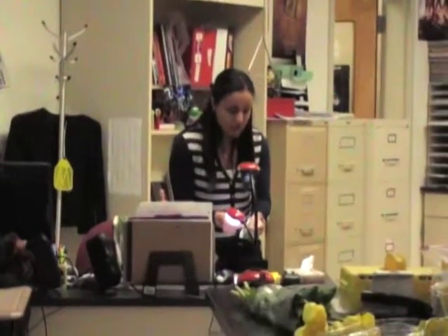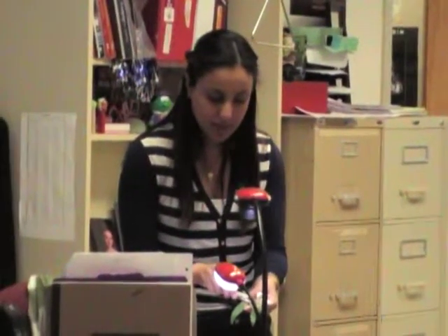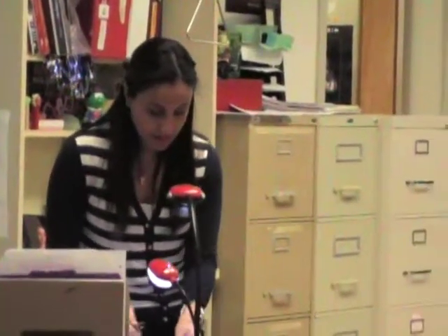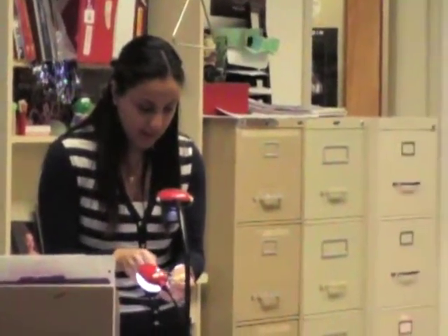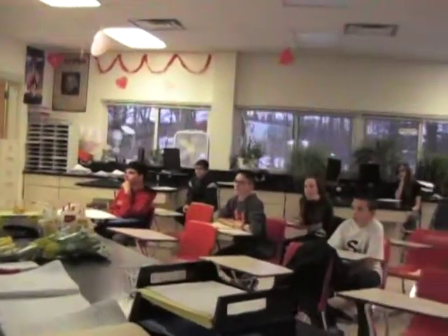Okay? And then you're not going to be able to see the ovary until you really dissect the flower and get down into this part that's covered by your sepal here. So you'd have to break open into it and get to the bottom to really see the ovary.